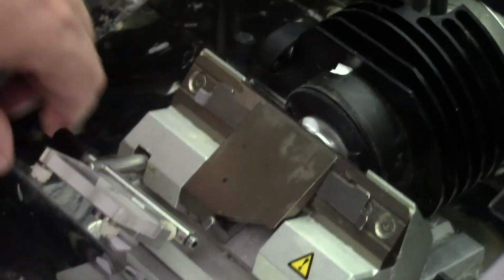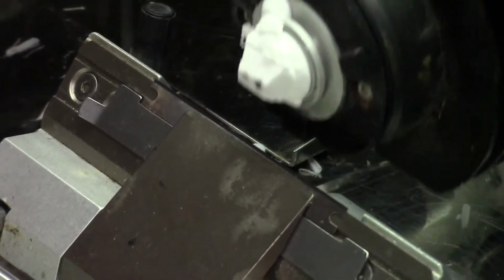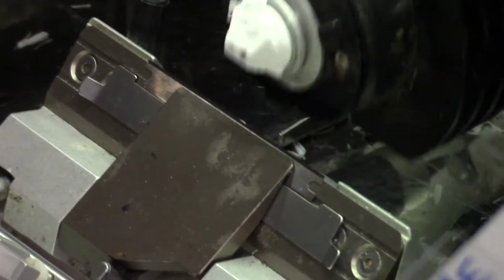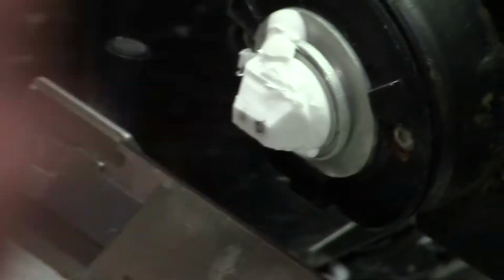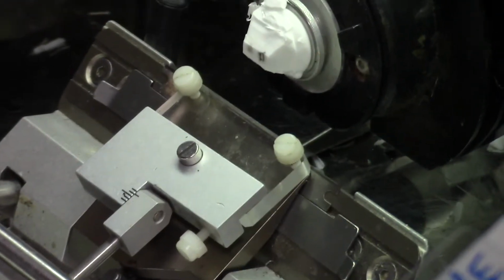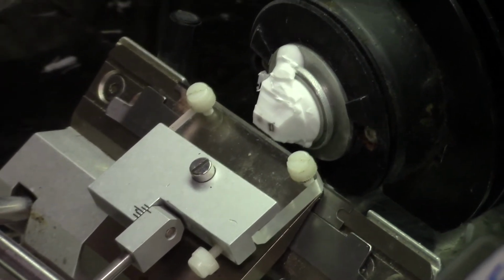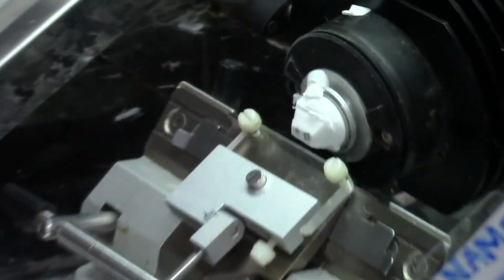As I was adjusting this, I moved the knife, and so I need to move the chuck forward until it starts hitting tissue sections again. We should get a snowflake here. Pretty soon there's some snowflakes. And there's a whole section. So I take my paintbrush, wash away that section, and now set this down, and let's see if we can get a flat section to go right under the roll guard. Get all the parts in the exact right position.